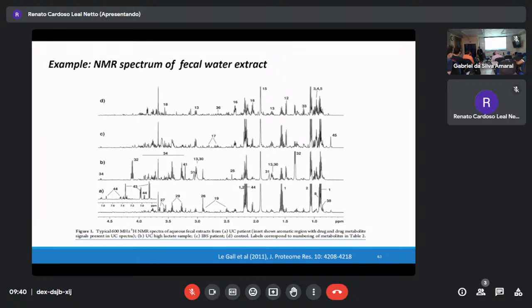So that's why she suggested we can add some acid, whatever, and degrade all the compounds. But always try the simple method first. Pesticide, herbicide, probably there is some. But I would prefer, after centrifugation, to immediately go to NMR because NMR is a non-destructive method. After NMR, you can measure it again. After NMR, I have a look at what kind of compound it is. If we find something, then you can make a second plan.